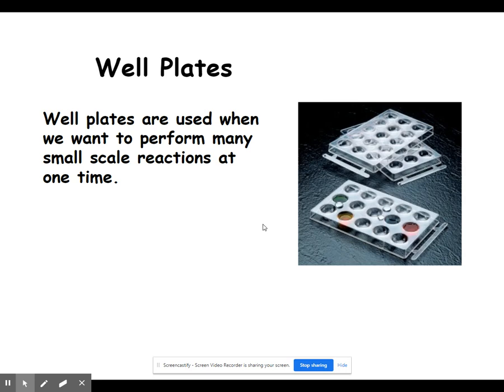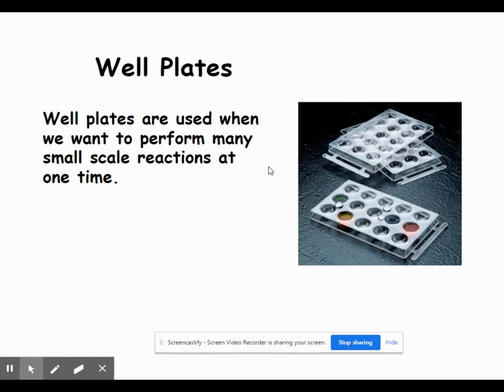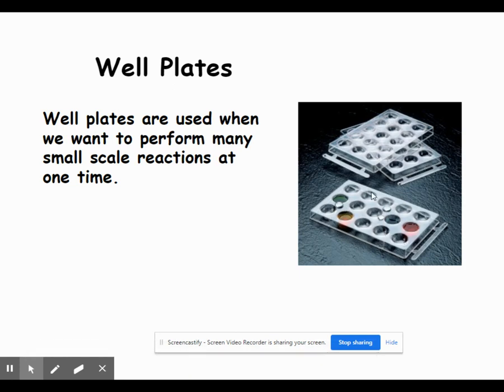Well plates are pieces of plastic with little indentions called wells. We can do reactions in these wells. Instead of using a beaker to do a reaction requiring a large amount of chemicals, we can use well plates and use very small amounts of chemicals to accomplish the same reactions.